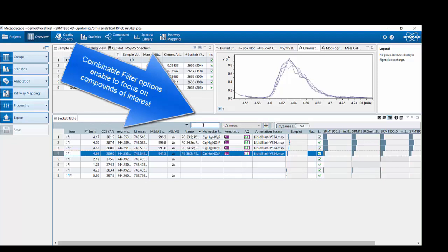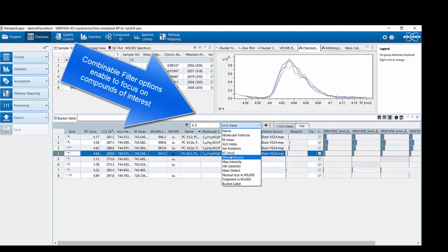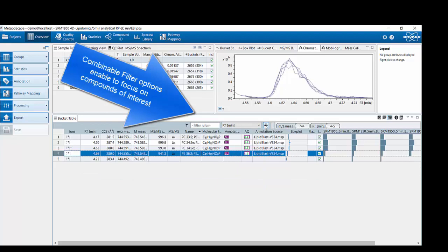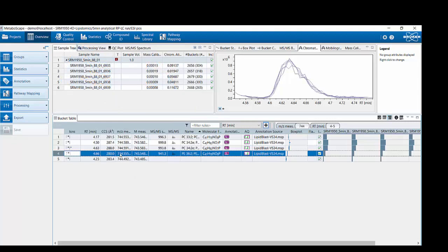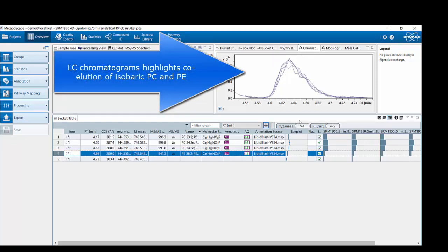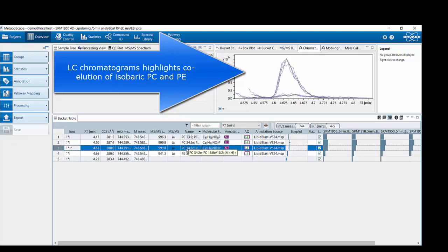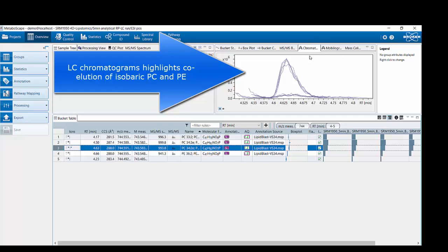I also know that the lipids I'm interested in will elute between four and five minutes, so I can apply multiple filters to really focus my attention. You can see this is the PE 36:2 which I just showed in the presentation. Looking at the retention time, it's eluting at 4.63 minutes, and we have the isobaric PC species eluting at really the same retention time, as we can see in the chromatographic view.